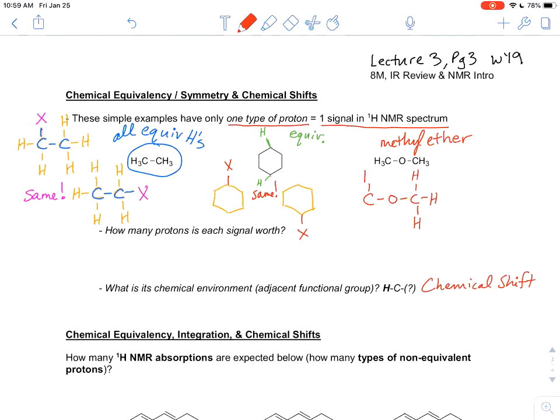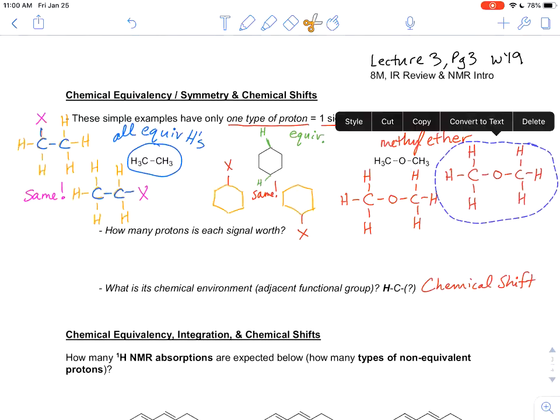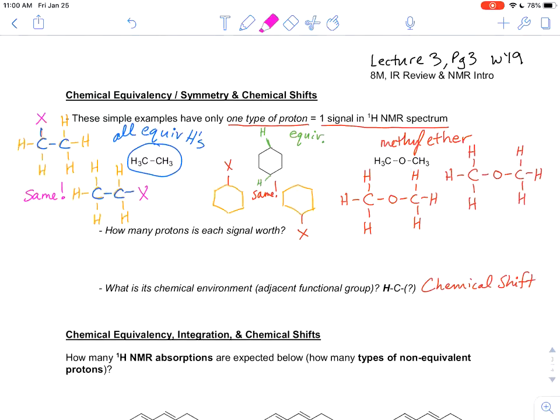All of the hydrogens in the whole molecule are equivalent to each other. We can use our, not really a trick, it's just the way to really do it, to figure out if any two protons are the same or different. So here's two drawings of the same molecule. Let's ask ourselves a question, are these two the same? They're connected to the same carbon, so the answer should be yes.